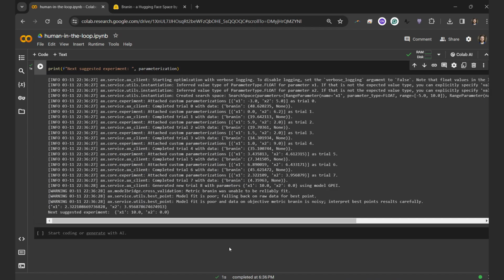Okay, so if you can imagine here, this is something where notice that you can start and stop the Python script, your optimization script, and bring in those results manually.